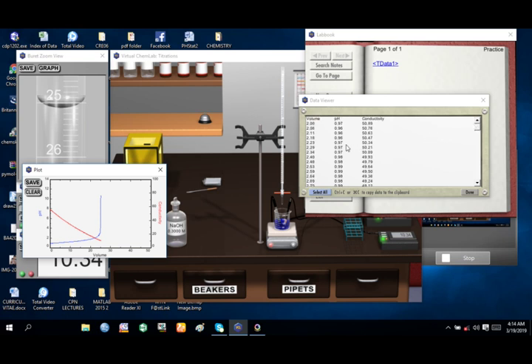You see the volume, you see the pH value, you see the conductivity value. When you scroll it, it can give you the required result. You can select all by clicking here. When you select it, you can copy by clicking Ctrl C and take it to Excel program for analysis.